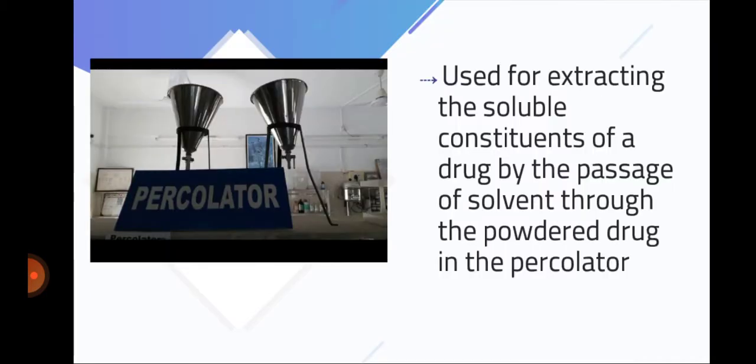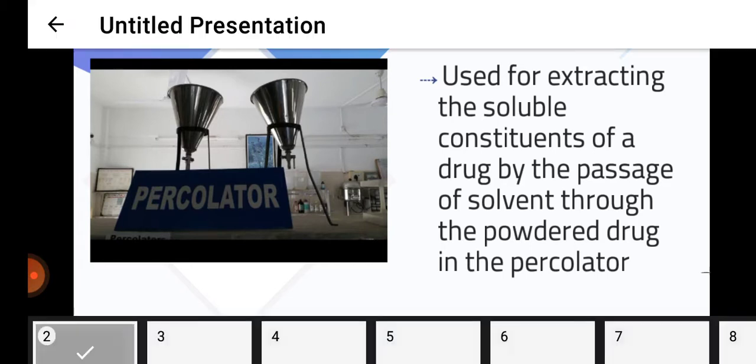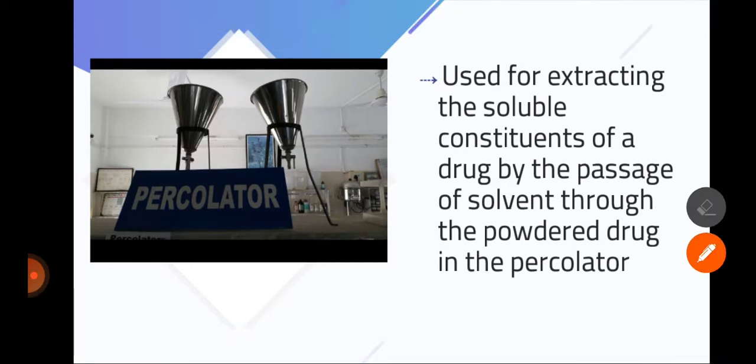Percolator is used for extracting the soluble constituents of a drug by the passage of solvent through the powdered drug in the percolator. If this instrument is used, then you have to identify it.